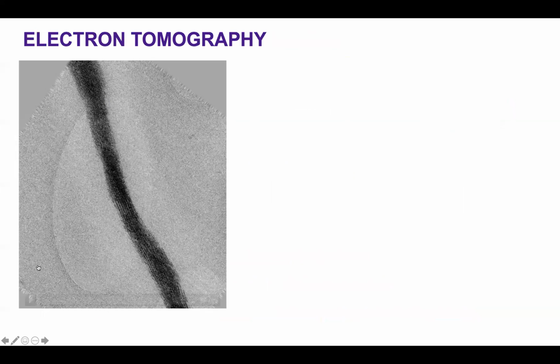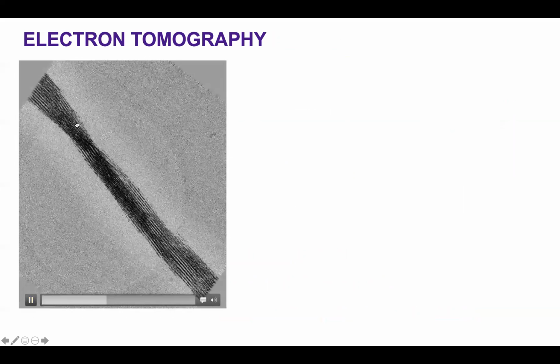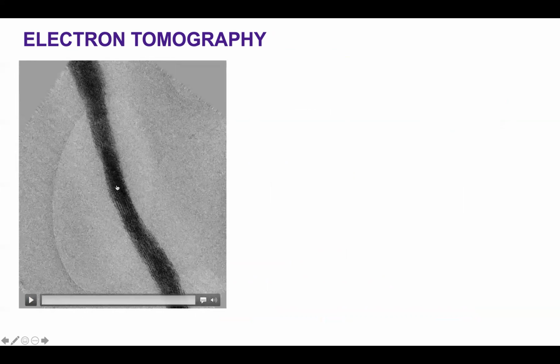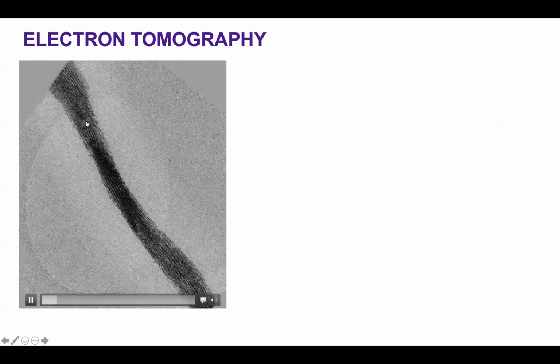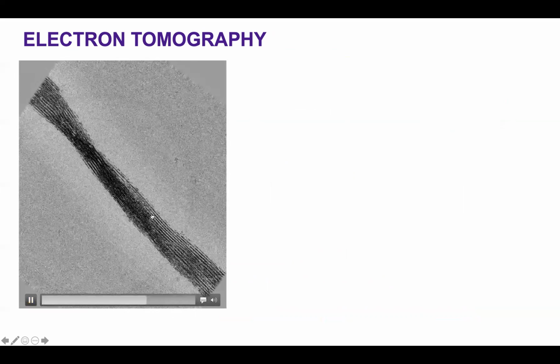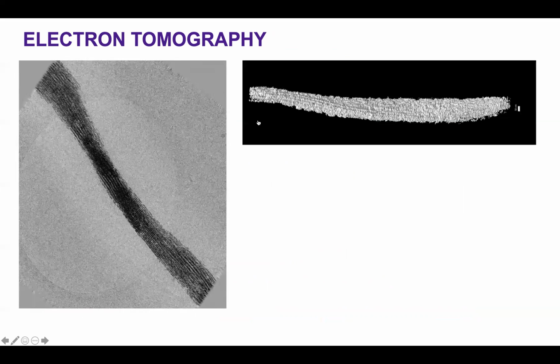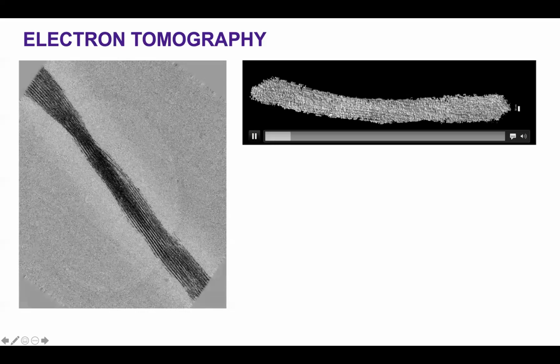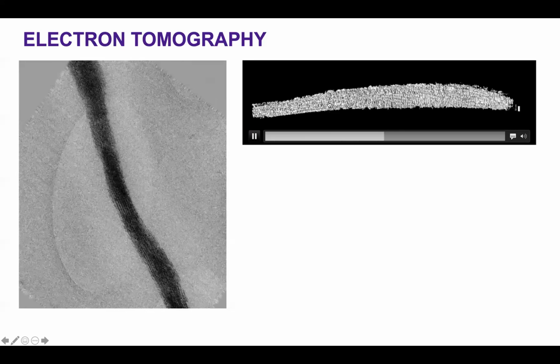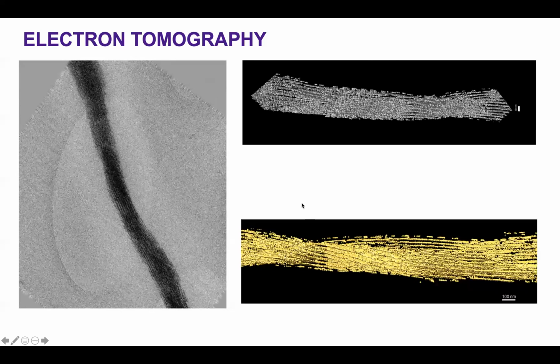For that, what we look at is Cryo-TEM and electron tomography. It is the same virus nanoparticle hybrid long chain, just millions of nanoparticles arranged together with a large number of viruses into a higher order chain. What you see here is also some helical structure that is formed. Then if you do three-dimensional reconstruction, in this case, because gold and virus have different contrast, we start to see only the gold nanoparticles here. Of course, by adjusting the contrast, it's possible to look at the virus particles.